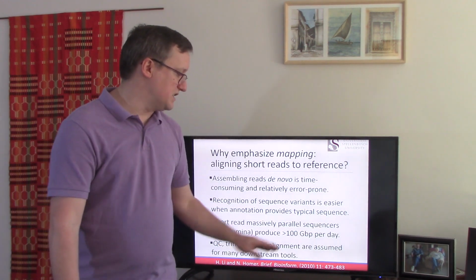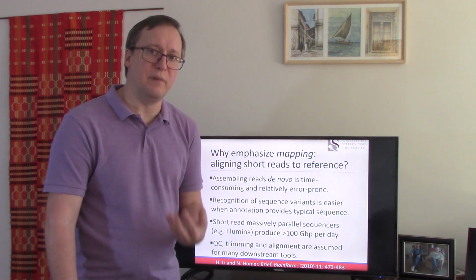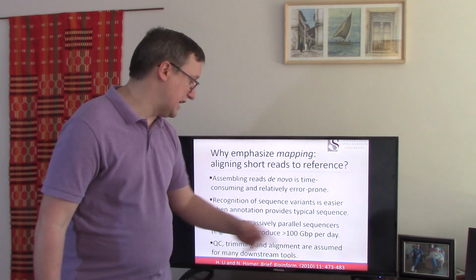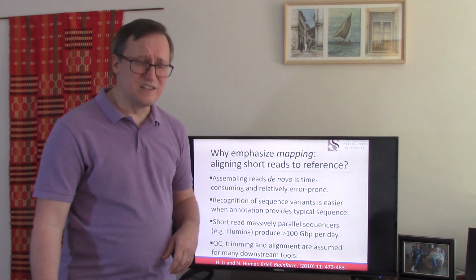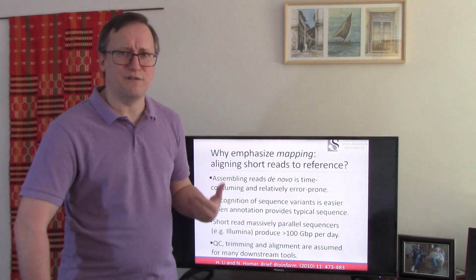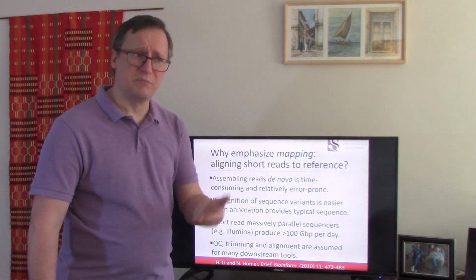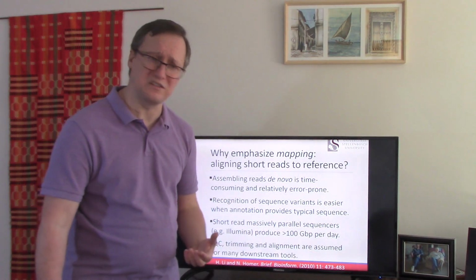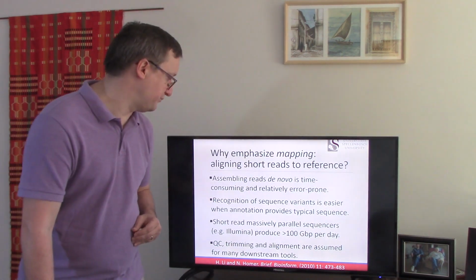Now, I think it's been apparent early in this lecture that massively parallel sequencers generate millions of reads. A lot of these can produce more than 100 gigabase pairs of sequence a day. So with that kind of data volume, your ability to keep up with data collection probably means choosing the most efficient route for making sense of those data that's possible. In this case, that's probably mapping rather than assembly.